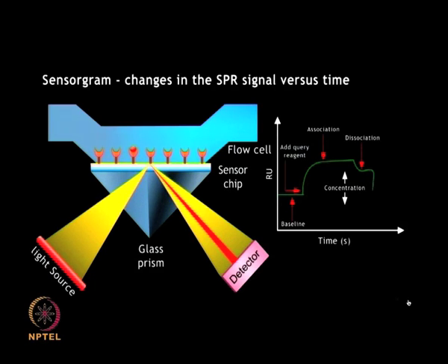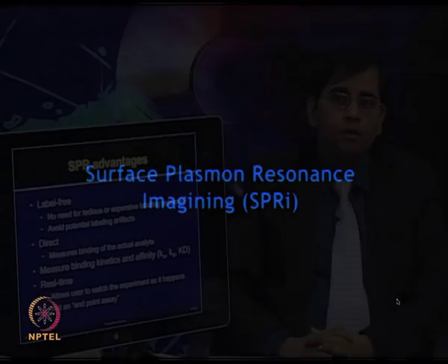After the SPR run is finished, same chip can be reused by applying a mild acid treatment and further washing steps by a process known as regeneration.